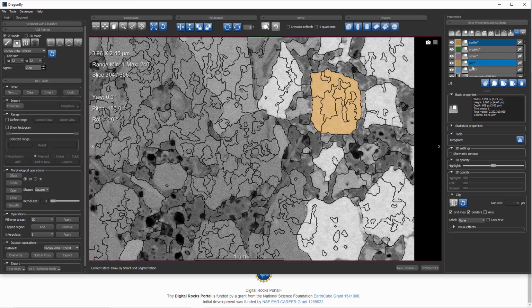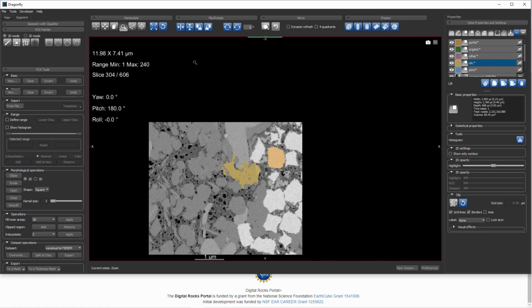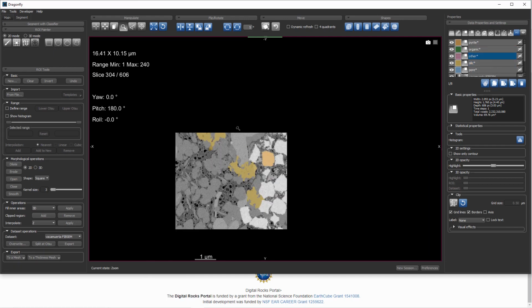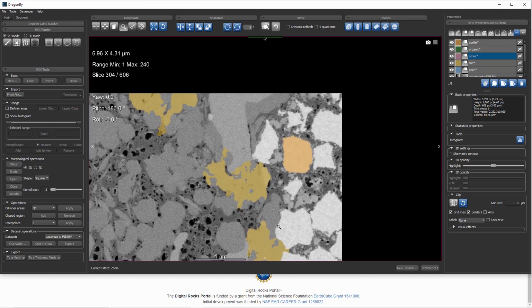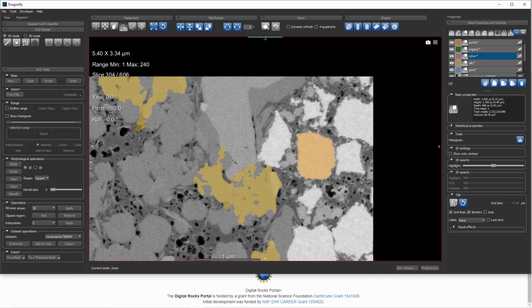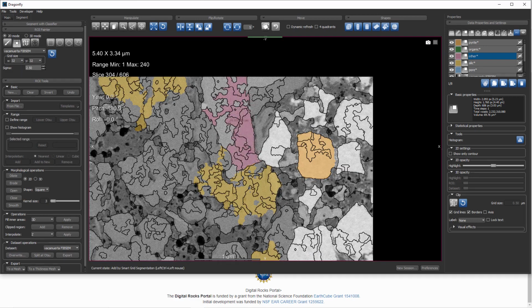Now let's go to the bulk grains, which are these guys. Get some of these grains painted. We'll zoom out a little bit, get some of this. I don't like that, so just paint some pixels here. Then we'll paint this other grain. Where was it? It was a little bit darker or a little bit brighter. Oh, maybe this grain. Is that it? Oh no, this grain is so much brighter than the rest. So we'll call that a different grain.